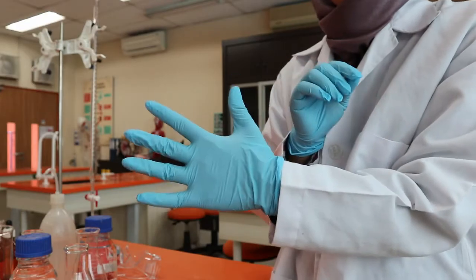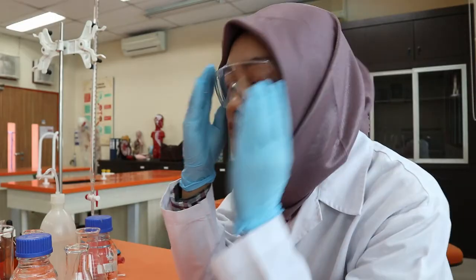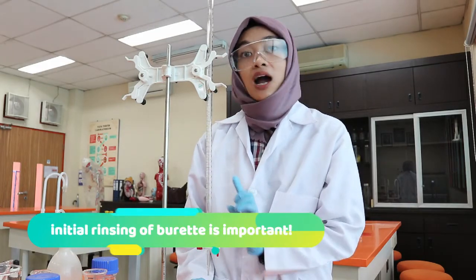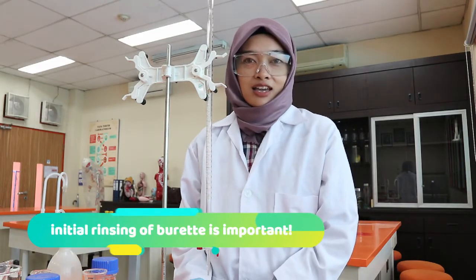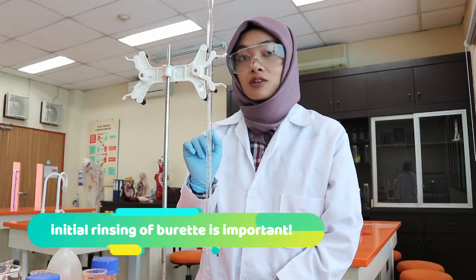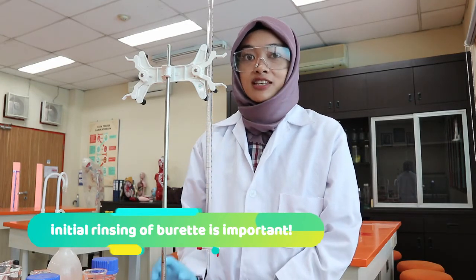Wear your lab coat, your gloves, and your safety goggles. We have to always rinse our burette before we do our experiment. Why? Because there might be a little bit of impurities present on the inside wall of the burette from a previous experiment.